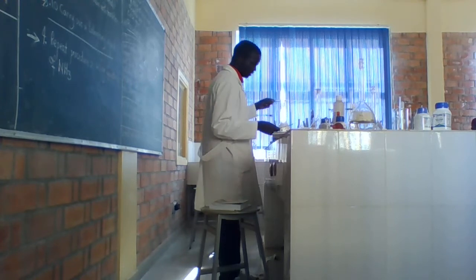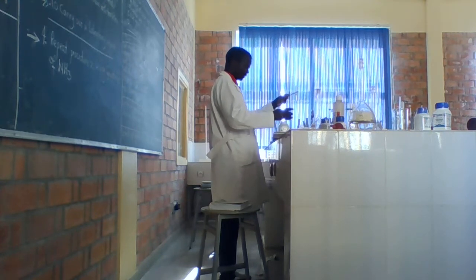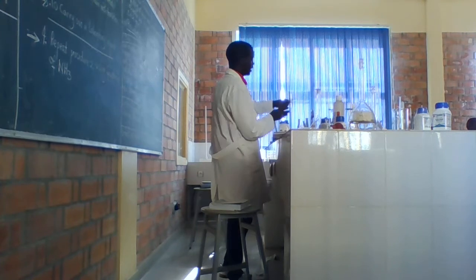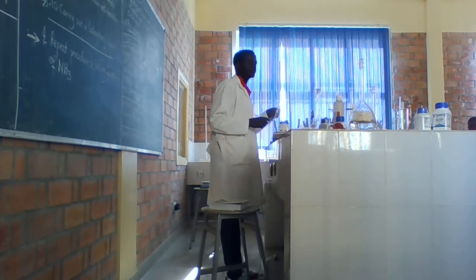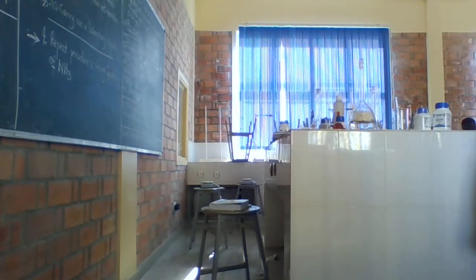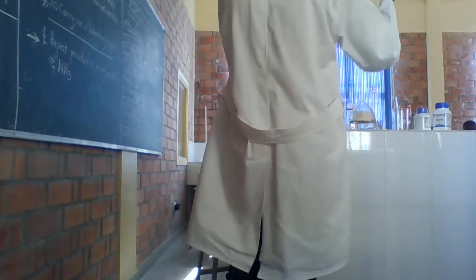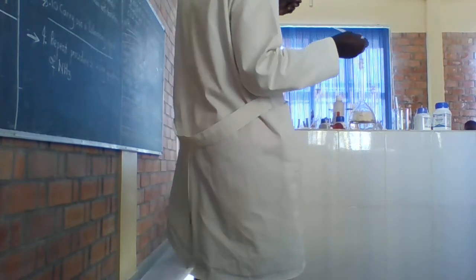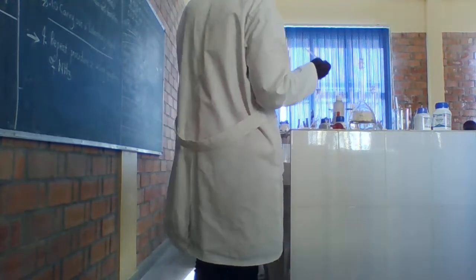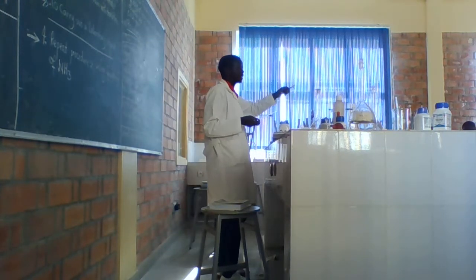So you may have a different quantity from what I am using here. And then I shake. I use any example of a given solution to mix it and then observe the change. I observe the change after mixing with any given reagent.